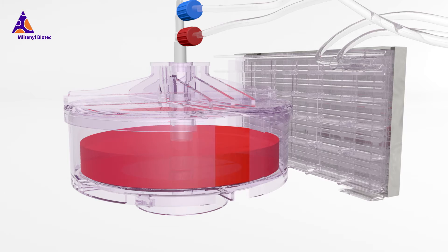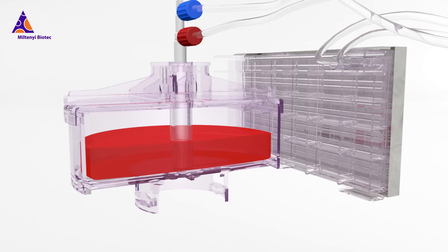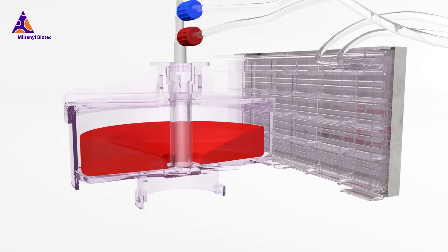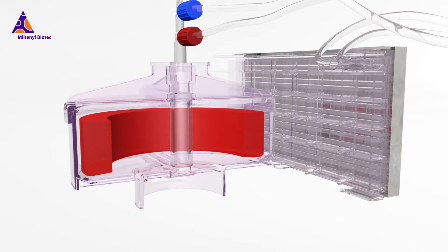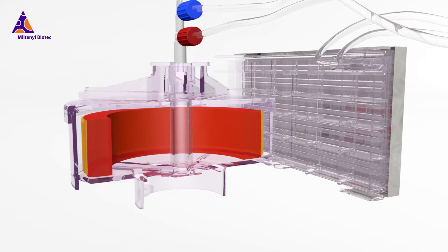To ensure ideal cell expansion, automated medium exchange is part of the Clinimax Prodigy cell manufacturing process. Cells and medium are separated by centrifugation.